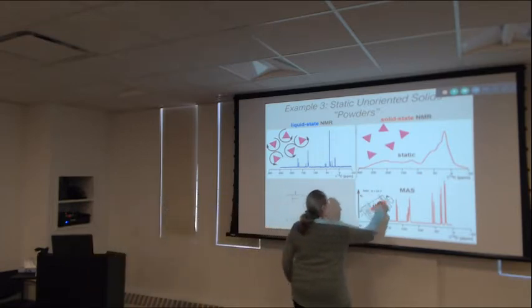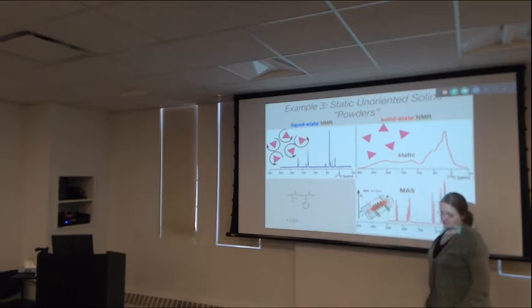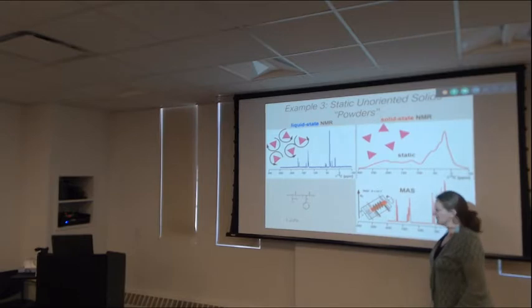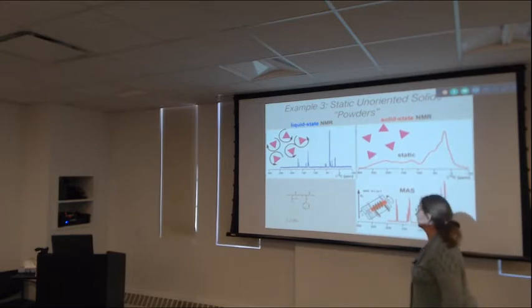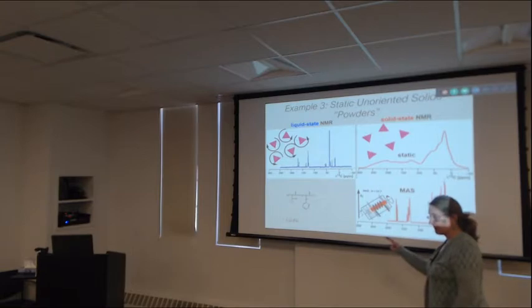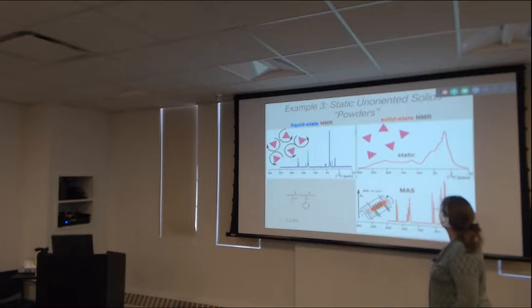So that's the experiment, and now you've got a coil around that sample holder. The air is blowing here to get it spinning, the coil's here, and a coil does NMR like usual, just like we talked about in solution, except that we tend to be interested in getting stronger pulses, pulses with a stronger field. But besides that, it's very similar. But you're spinning the whole time, and we're going to do the mathematics of what happens to the instantaneous frequency when you spin, and therefore what happens to the magnetization, and what happens to the spectrum. That's the mathematics we're going to do.